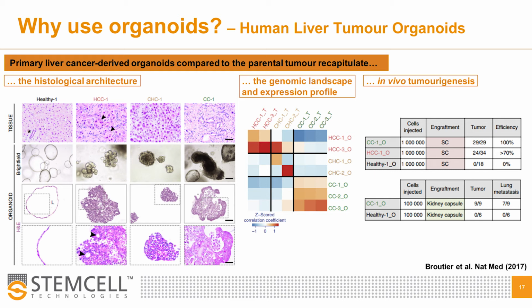Since primary liver cancer metastasizes primarily to the lung and also the lymph nodes, tumoroids from a patient with a history of metastasis were transplanted into immunodeficient mice. As expected, 100% of the injected mice developed tumors that resembled the original patient tissue, but more excitingly, in 7 of the 9 injected mice, the authors found lung metastasis in agreement with the patient's diagnostic at the moment of resection.